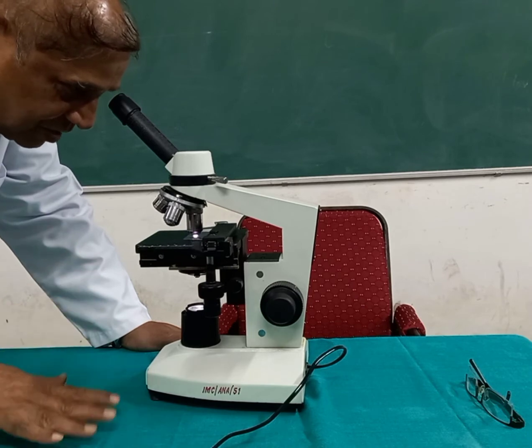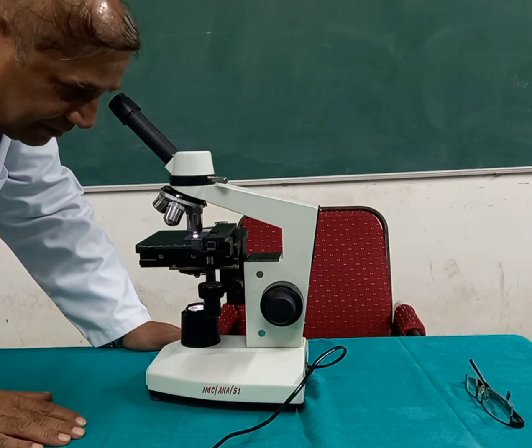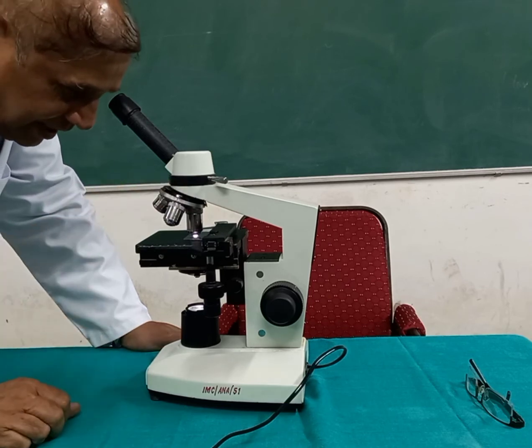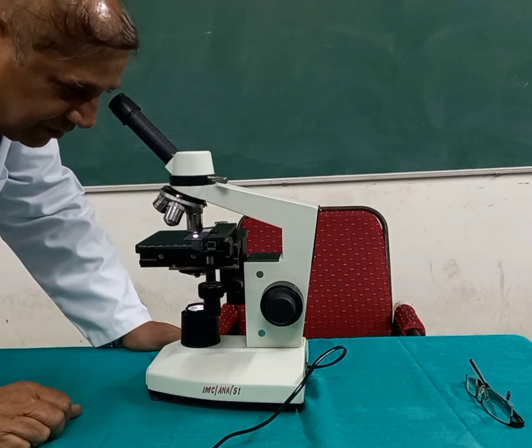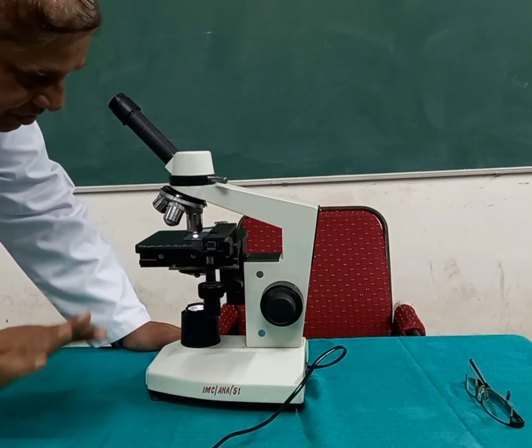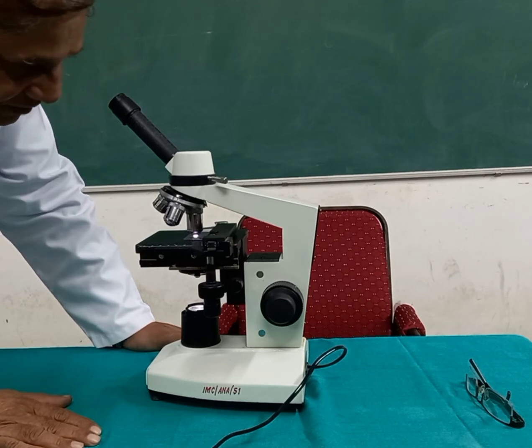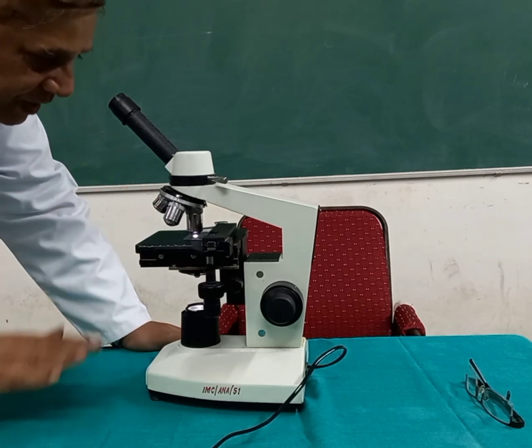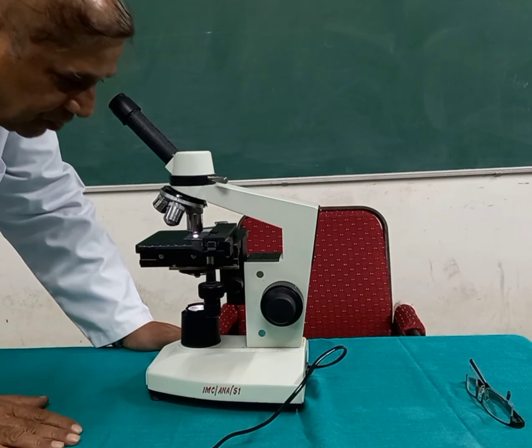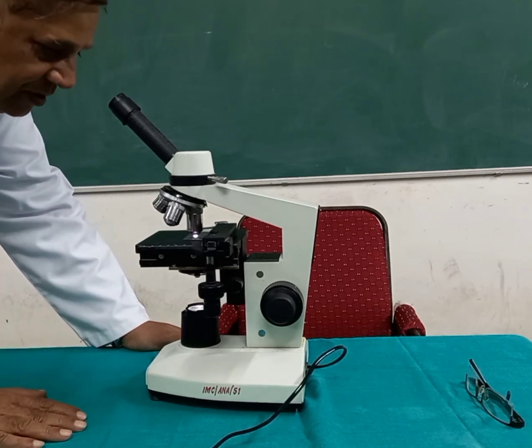I will suggest, because it is oil immersion, you will have to put a drop of oil and bring the 100x image, and it is a little difficult to begin with, so ask your teacher to focus for you if you want to see at 100x. Otherwise you limit yourself only up to 40x, which is enough for your studies. This is the way a slide is focused under the light microscope.